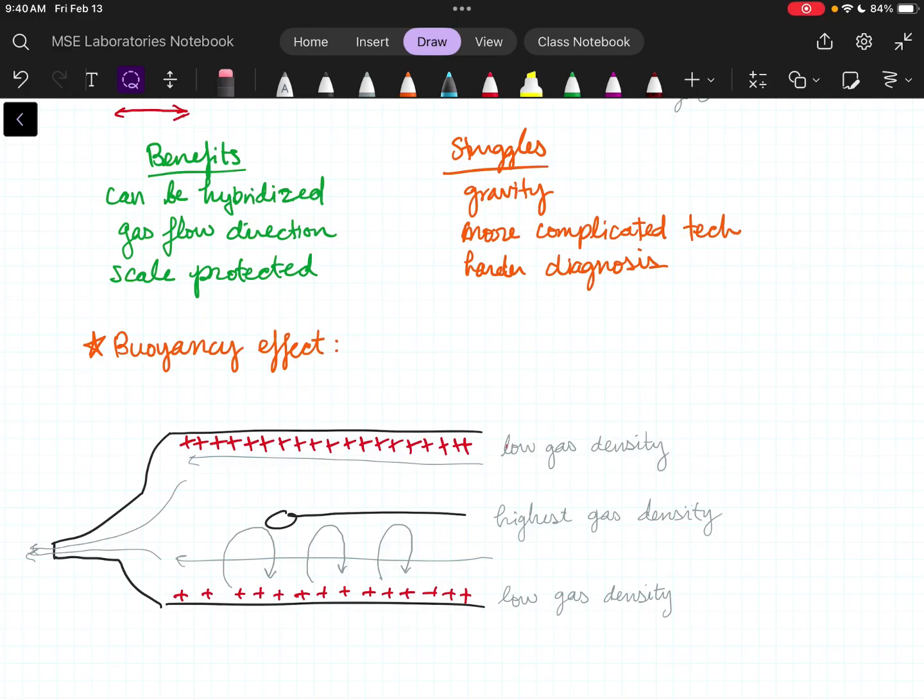So what we end up getting is, only in the bottom half, this sort of circular motion as gas heats and cools, and it's minor. This is the biggest difference when we turn on the furnace from zero. If I start at room temperature and then I'm like, ready, go, it's the most obvious in those couple of moments at the very beginning.